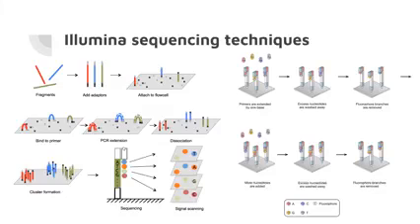And then we apply what we call primers. So these special sequences here attach to the adapter on the top of your fragment. So from there, we get special nitrogenous bases, special A, T, Cs, and Gs that fluoresce when you zap them with a laser, and we introduce them one by one. So for example, we introduce one base here.